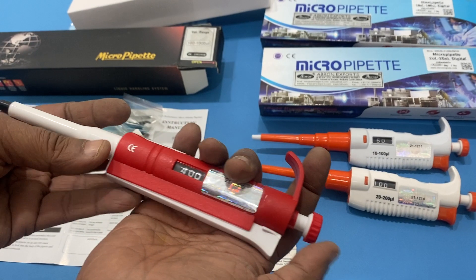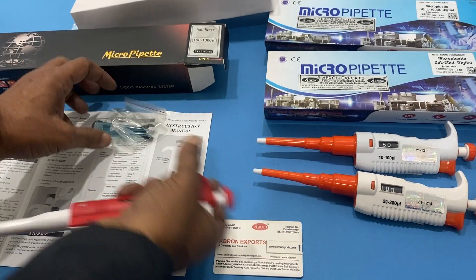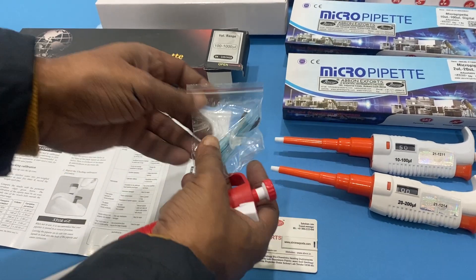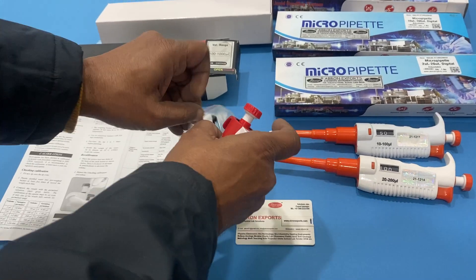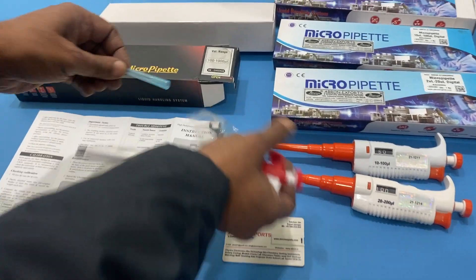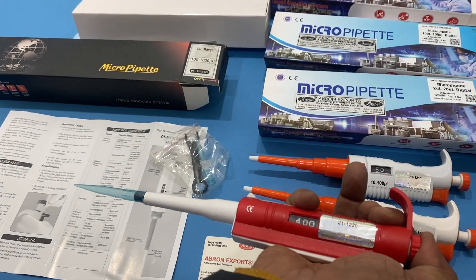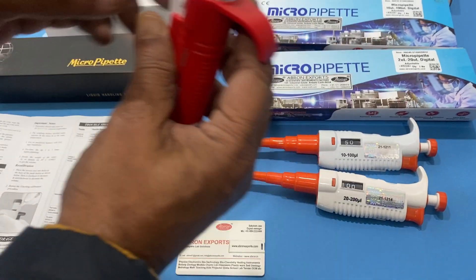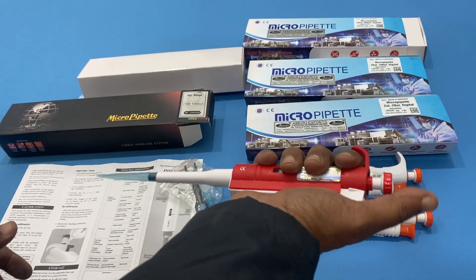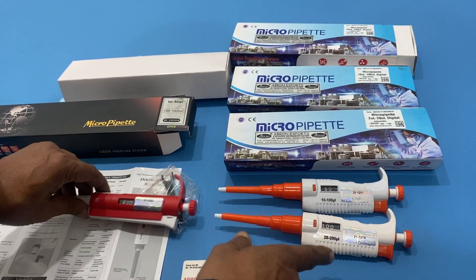So you push it and change it — say I want to take out a sample for 400, push it to set that. Then there are tips provided; you put one tip on the front. Push it and take out the solution, and when you press it, it releases the solution, and then it sucks it back similarly.